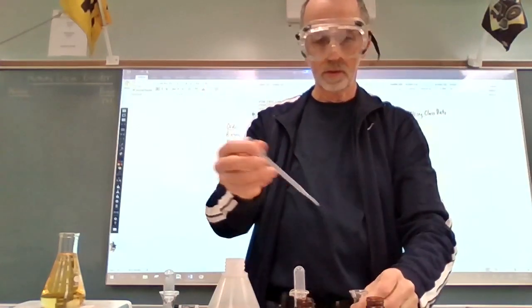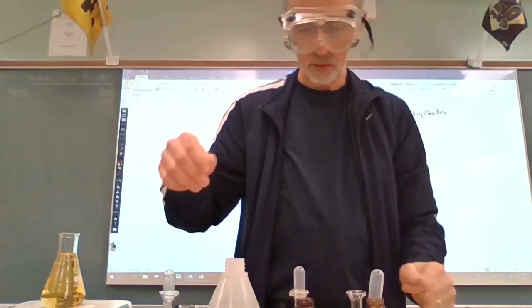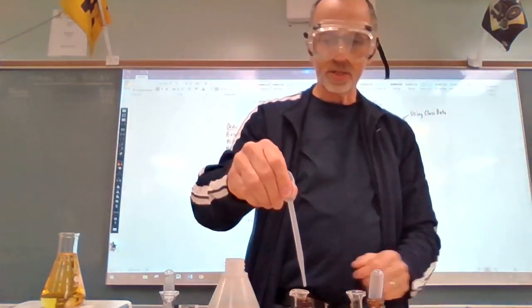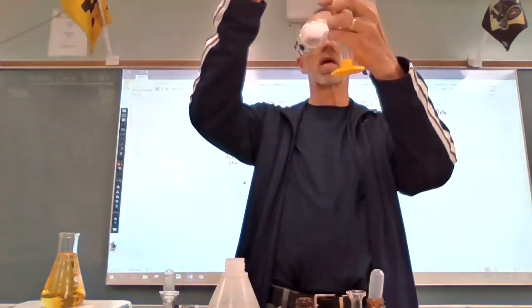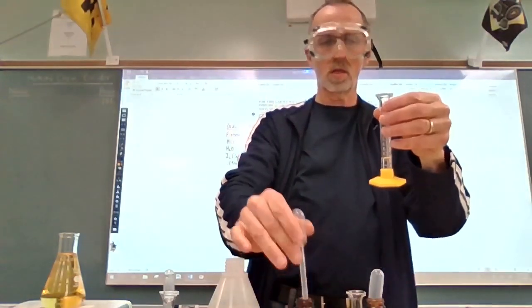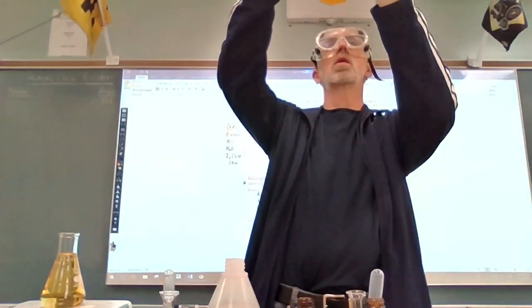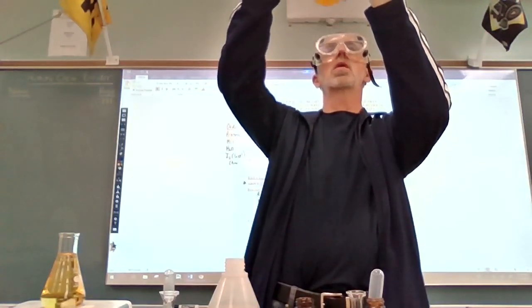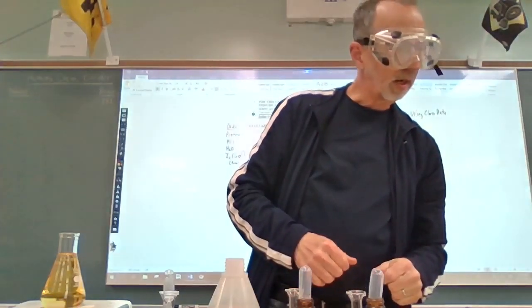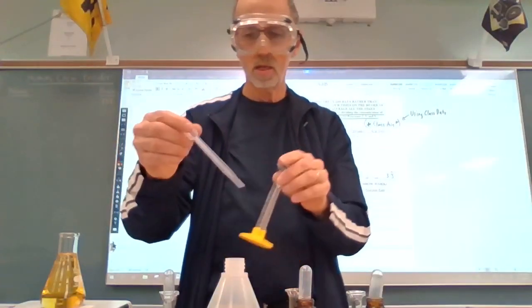There we go. And then we will add 5 mLs of HCl. And then 10 mLs of water.